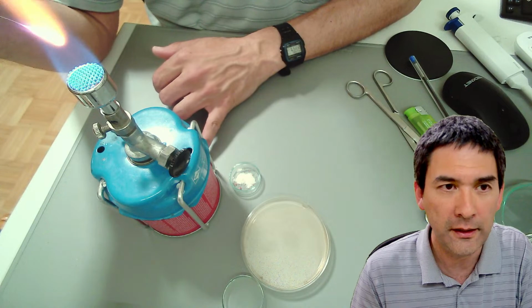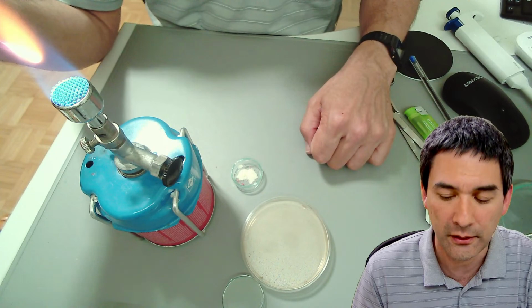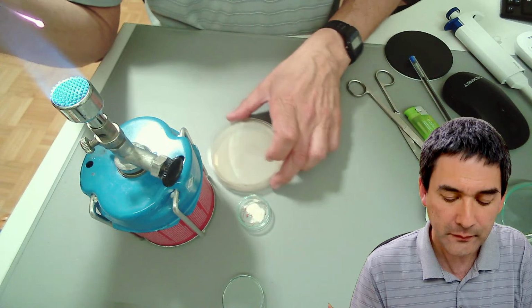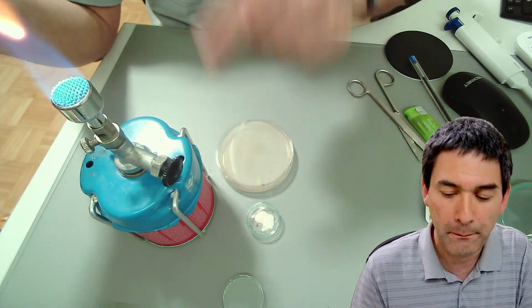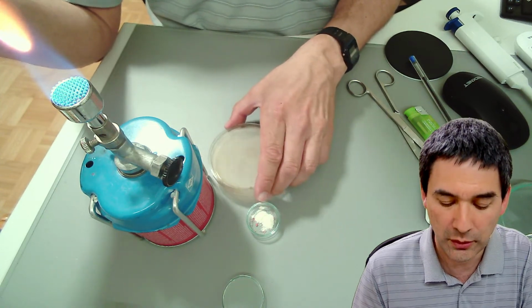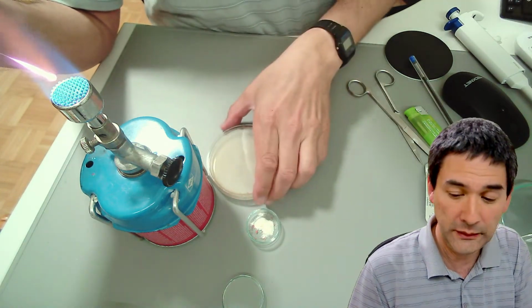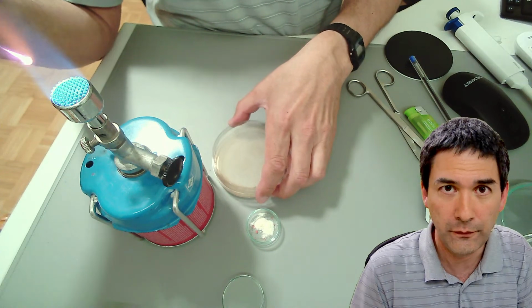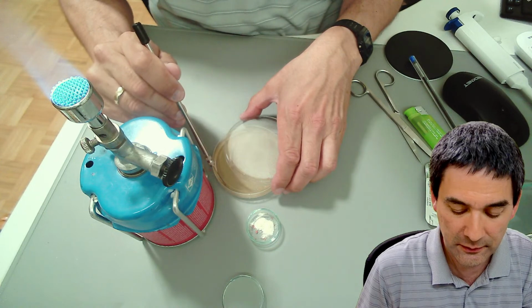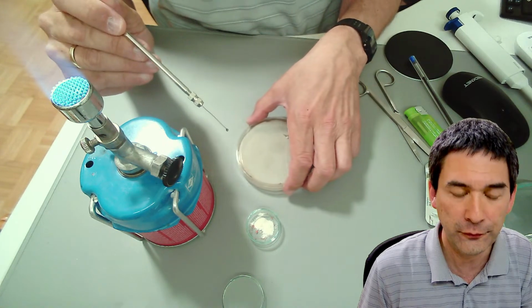And now I have a problem. If I basically take this extremely hot loop and go into the bacteria, I'm going to kill those bacteria. Or I might set it on fire, right? So what I'm going to do therefore is I'm going to cool it off by putting the loop into the agar medium, okay? So I'm going to carefully open the plate, only enough, I'm just going to barely open it, and I'm going to now put it here on the side. Okay? It's now cooled off, but free of bacteria.